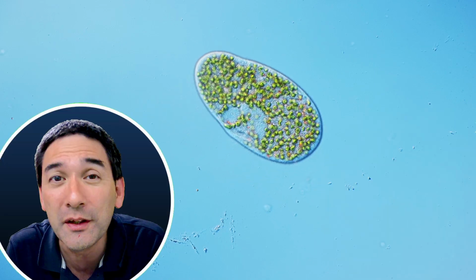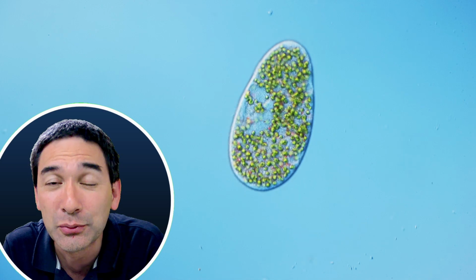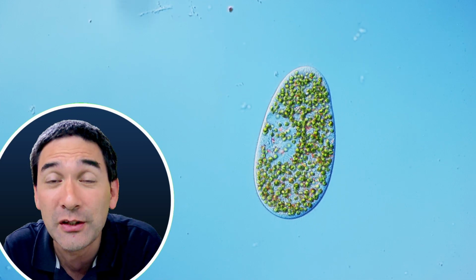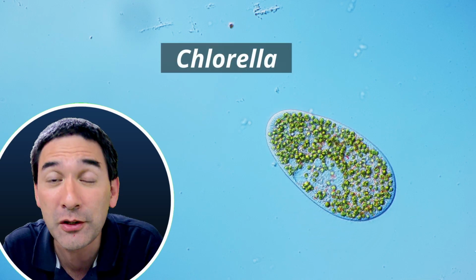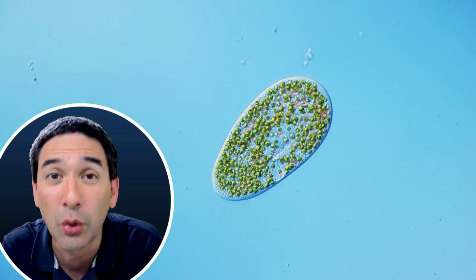But there is one interesting and unique characteristic that this protist has. Namely, it is quite green, and those green round circular structures that you see inside the Paramecium, these are algae with the name Chlorella. So what we have here is the Paramecium in which algae are growing.